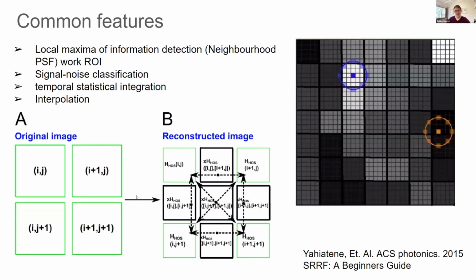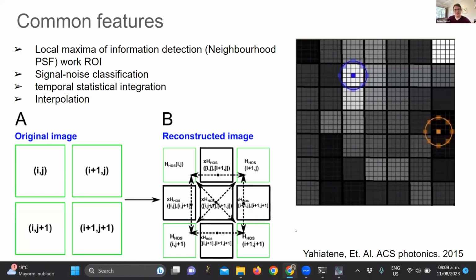So, should I interrupt you with questions? Of course. So, okay, there's one question in the chat about the fluorophores that are used for super resolution microscopy. The question is if any kind of fluorophore can be used based on their fluctuations, or if some fluorophores don't have fluctuation, and if you could, for example, even use autofluorescence.